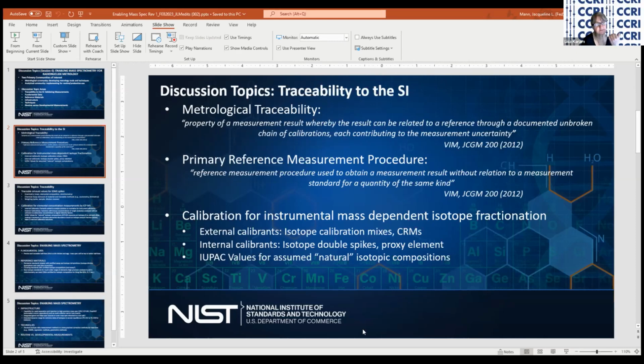I would just observe that Richard made an interesting statement. I think there are many cases, even in radionuclide metrology, where an executive decision has been taken as to what we will consider primary. I'm thinking specifically of the tracer methods used in liquid scintillation counting.